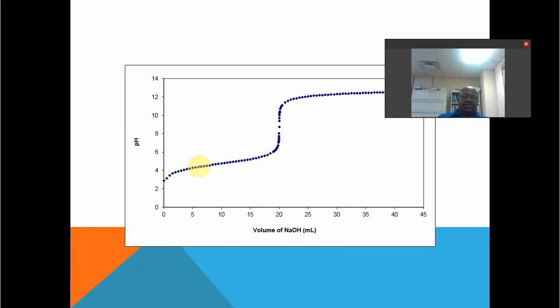We begin here, and you can see these go drop by drop. You begin at a certain pH. As you add the hydroxide, the pH changes slowly in this region, and then very steeply in this region. So that's a steep region, and then after that it kind of flattens out. So somewhere here we have actually reacted all the initial acid.